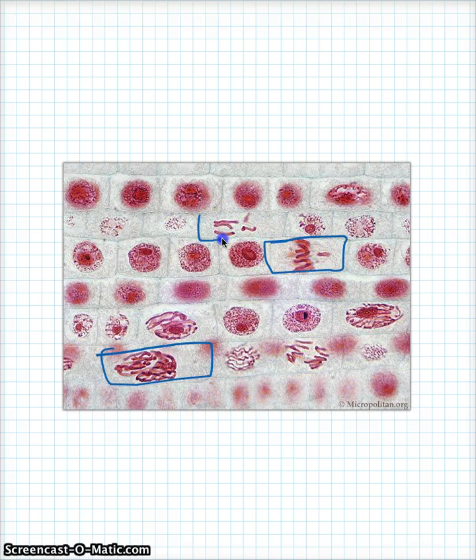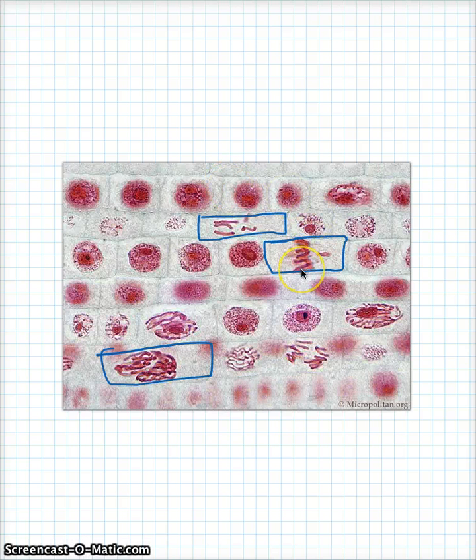This one, my students love this one. They're like, I don't even know what's happening there, Mrs. Penninger. Well, it's probably metaphase, but again, it might be that I cut half the cell off and left it somewhere else, so I might not even count that one. There's a good prophase.